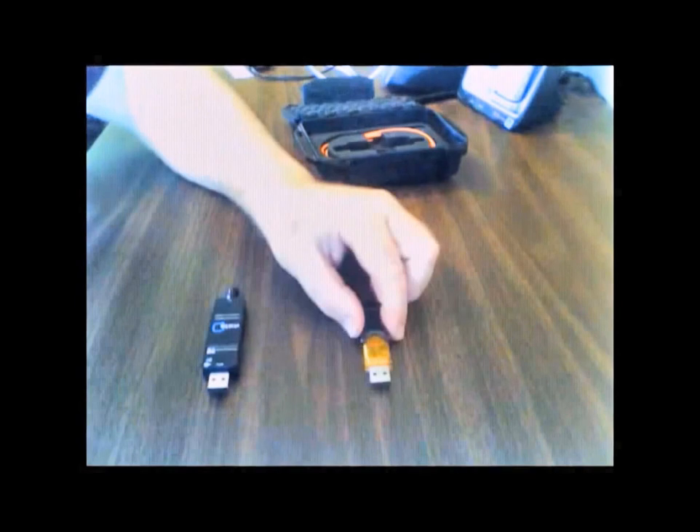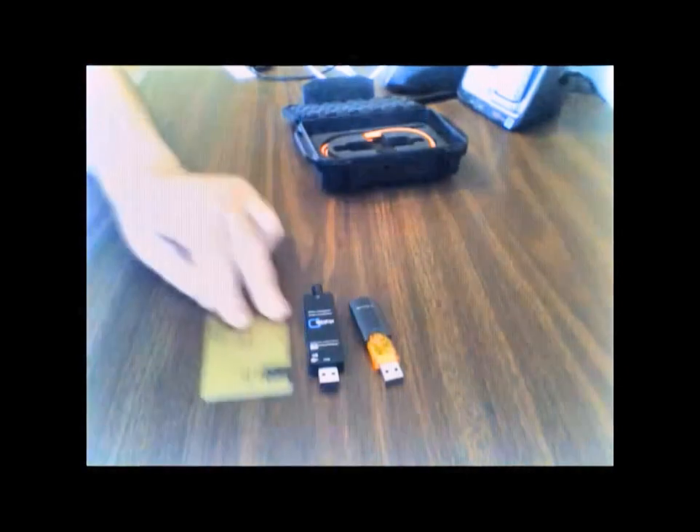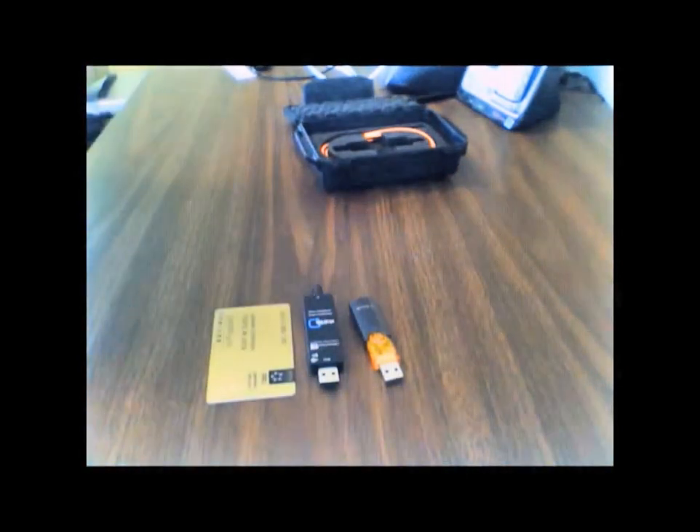We're going to compare it to an actual USB memory stick, which you have right next to it. And as you can see, they're fairly close in size. We'll do one more thing for size comparison — we'll put a credit card next to both of these. You can see how much wider the credit card is than either of those two devices. It's a standard size credit card. So there they are, all sized up.